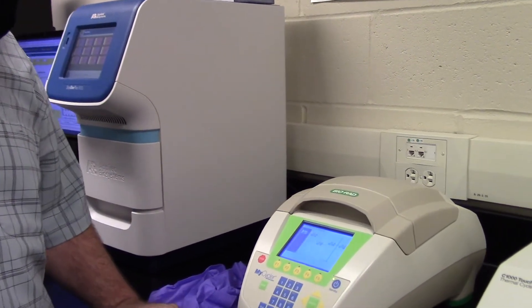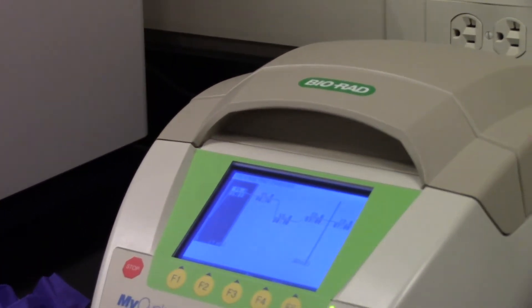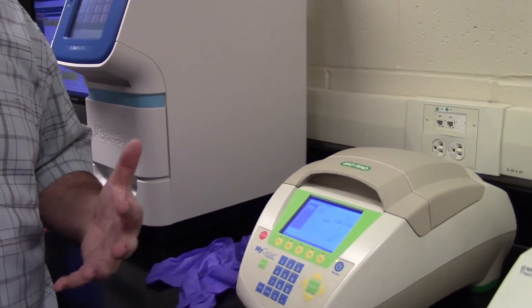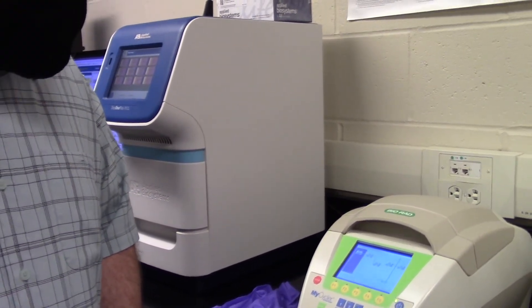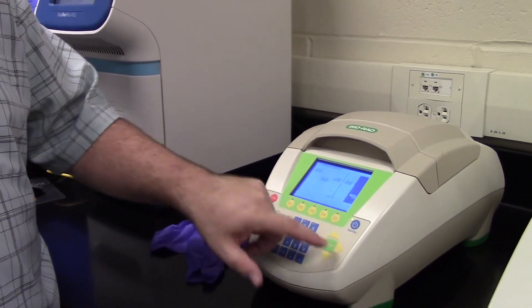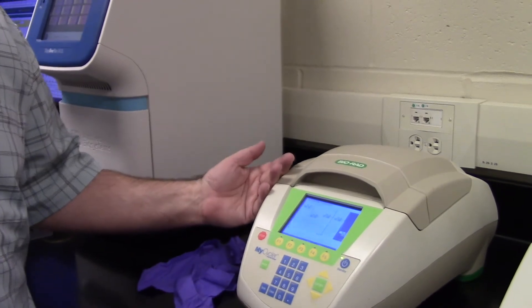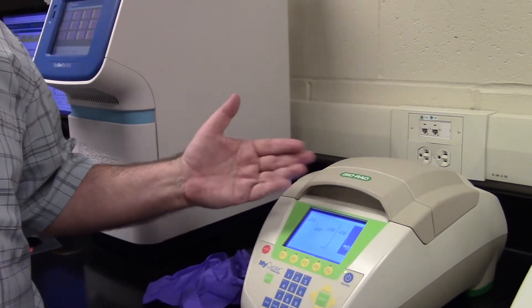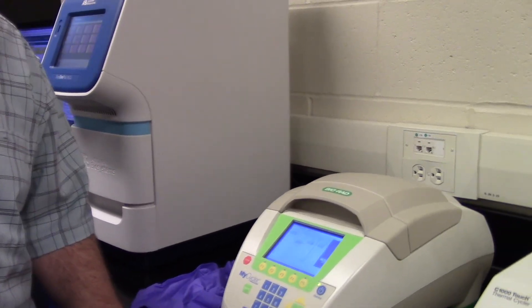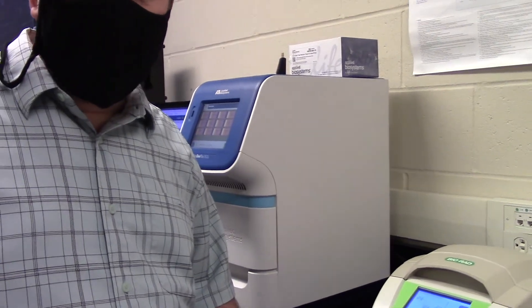The final step for PCR is 72 degrees for somewhere between 5 and 15 minutes, for any fragments that were copied but didn't get copied all the way to the end — we give Taq polymerase some extra time to finish any stragglers. Then the PCR machine is clever enough that it can actually hold as a refrigerator. At 4 degrees Celsius — the temperature of a refrigerator — it will hold the PCR tubes there. DNA is completely stable at refrigerator temperature.